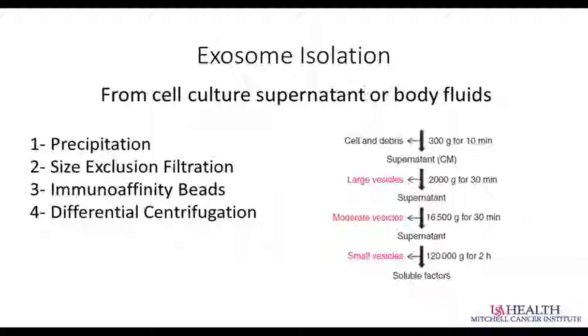But in the early days, you really could only see small beads on the flow cytometers, and that was really the only way you could qualitatively assess what was on the surface of an exosome, by using the bead capture method.